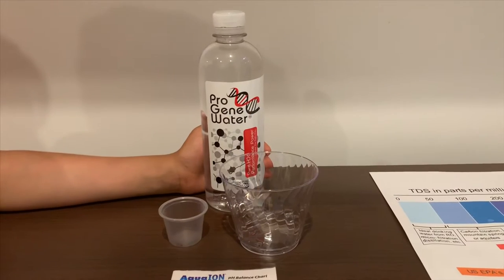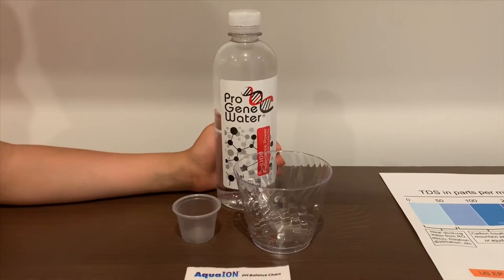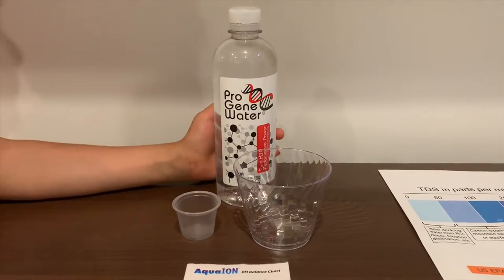This is Pro-gene purified water. It's sourced from California and it costs $1.19. Let's test the pH and TDS.